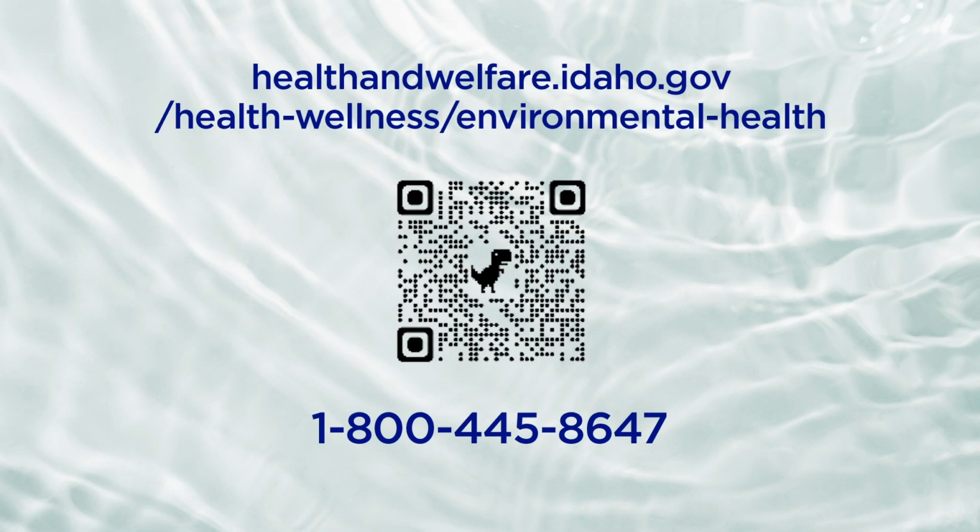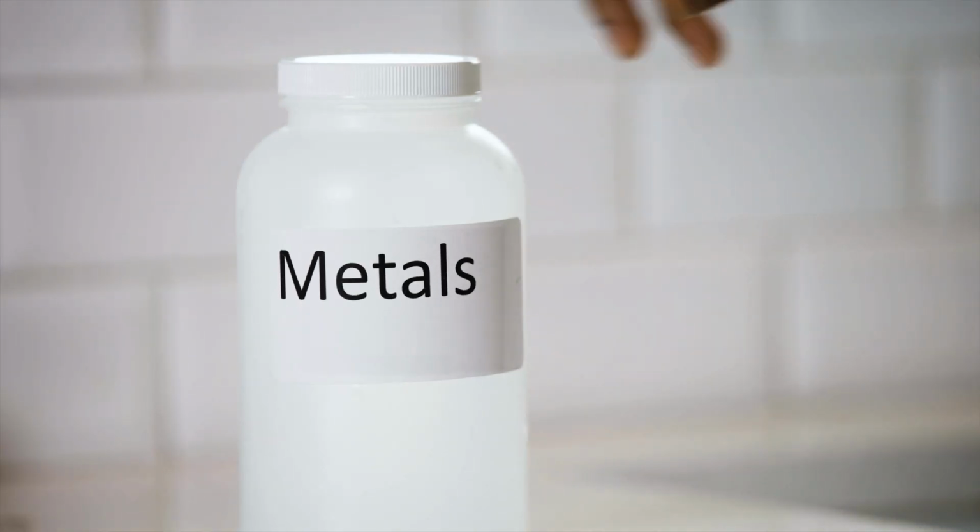Now, we'll shift gears and talk about sampling steps. Step 1. Contact your local laboratory for a sampling bottle. A list and a map of laboratories can be found on the Idaho Environmental Health Program website. When you contact the lab, it is important to let them know you are testing for lead and copper and need instructions and a sample bottle. Once you have the 1 liter sample bottle, be sure to collect and return the water sample using the laboratory's instructions. Pay attention to instructions on when to collect the samples.